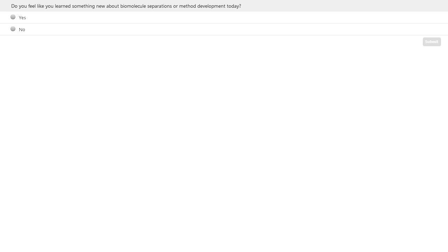Okay. Next question. What do you mean by long equilibration times? Are you referring to priming the column or analyte equilibration with the column?